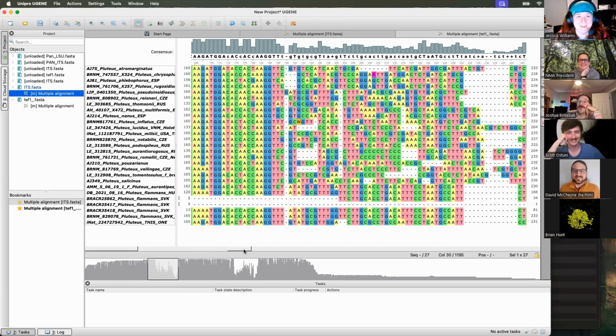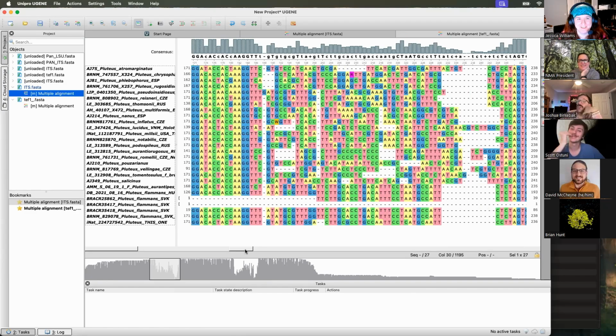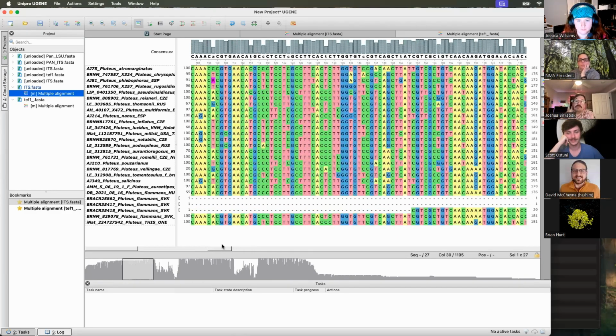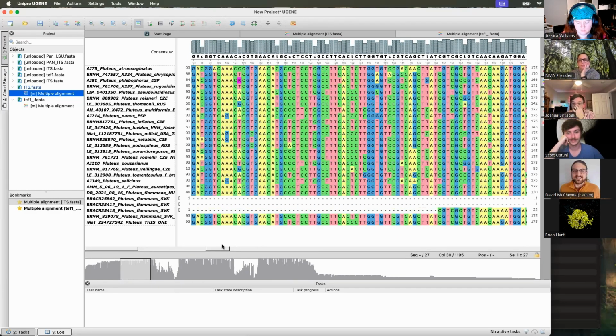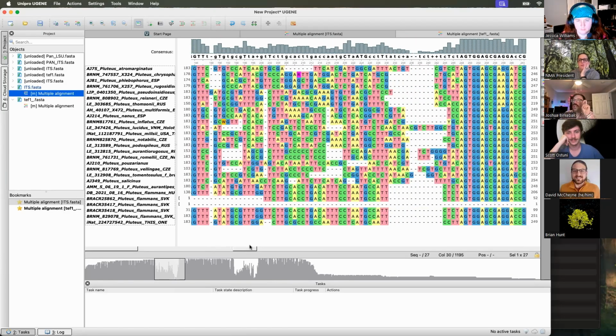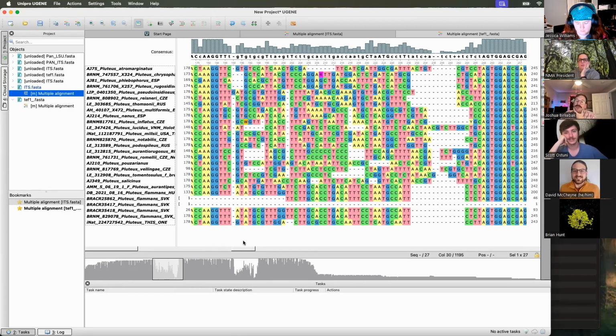What we're going to want to do with this is definitely trim out these introns, because we're going to tell the software this is a protein coding region and I have these codon positions, and those are evolving completely differently than introns are evolving. Introns are not totally junk DNA in the way that we might have used that outdated term.